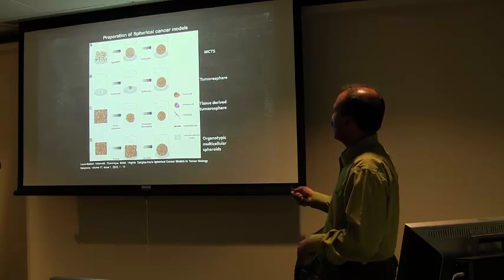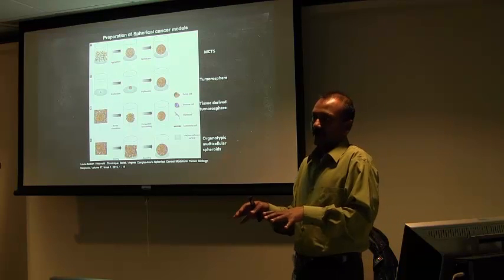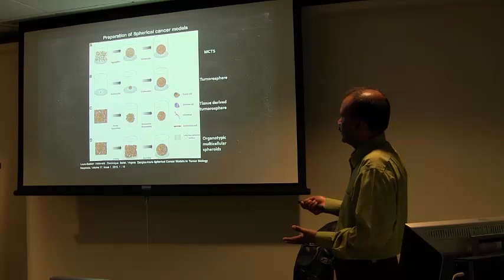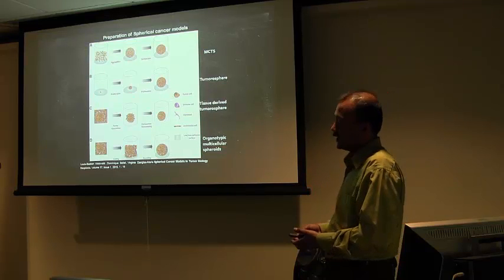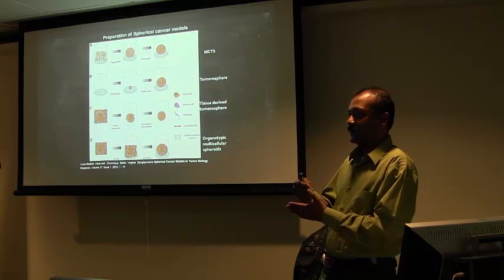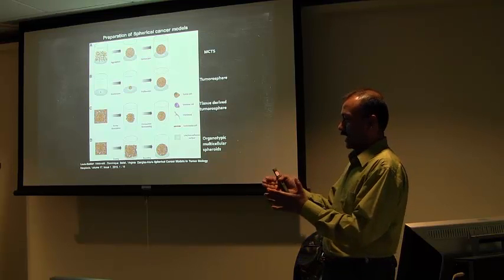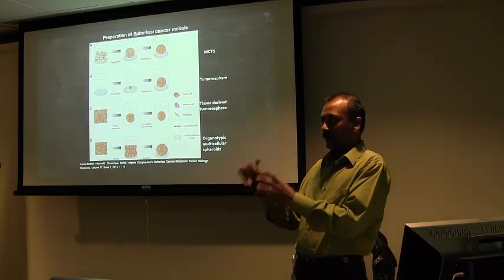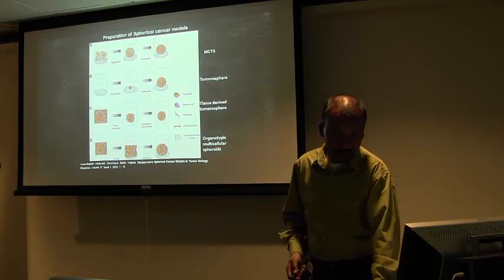But this model specifically preserves the properties of cancer stem cells, like self-renewal and clonal expansion. So this is currently a very popular way to culture tumor-initiating cells, or to do tumor heterogeneity assays, where you can look at how many of these tumor-initiating cells are there in a particular population of cancer cells. So I will talk about this in a little bit.